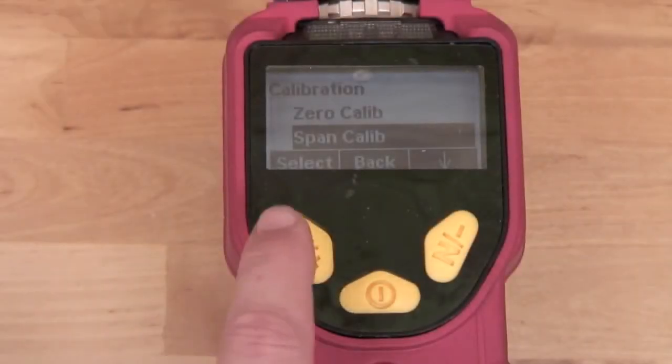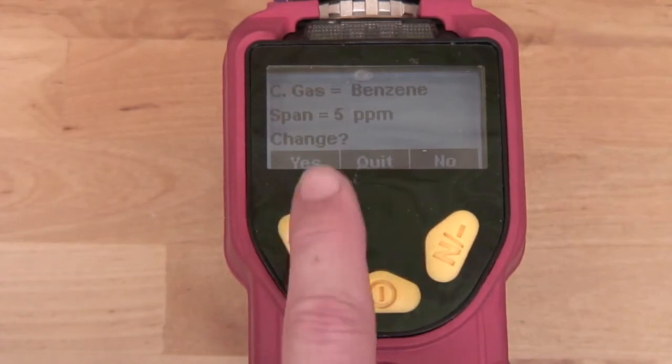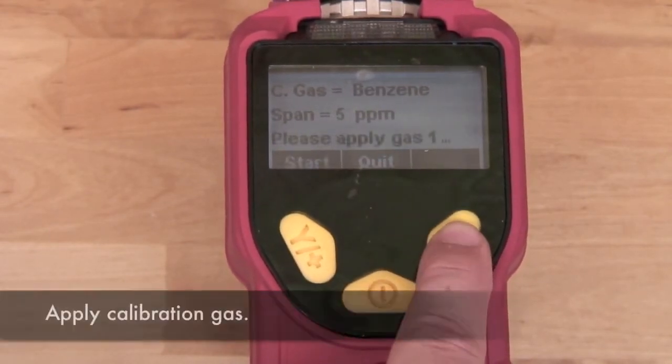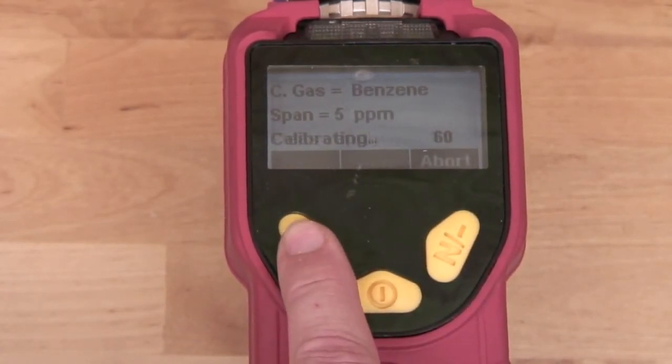To perform a span calibration, select Yes. Since we're calibrating with five parts per million benzene, select No. We apply our benzene calibration gas and select Start.